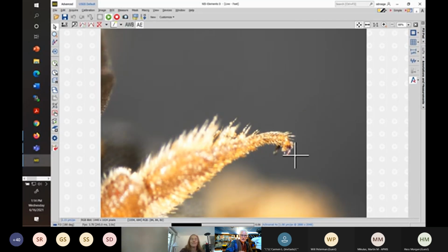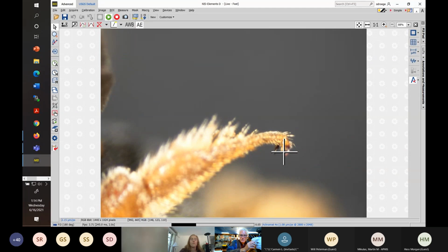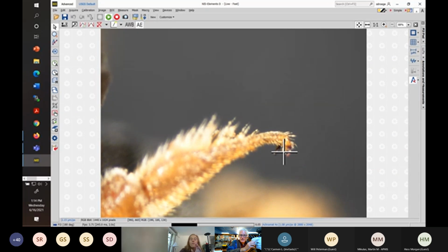All right. Here is the leg. So we have, I believe, basitarsus and tarsal segments, and at the end is the claw, and in the middle, I'll try and change the perspective on this, is a pad. So Anthidium, which looks remarkably like Anthidiellum, no shelf-like thing, but something that if you didn't see it, you might also think maybe it does have a shelf, but it has no pad between the two tarsal claws.